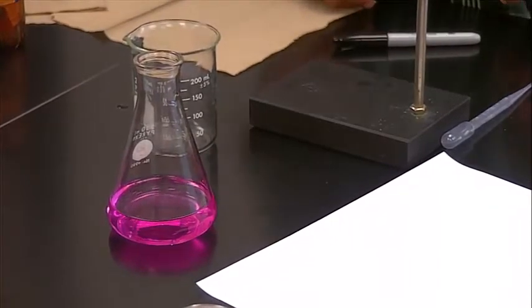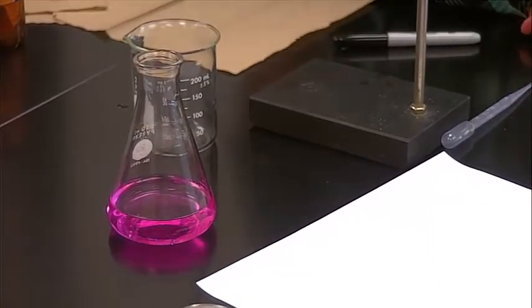Let's read now what we have in our burette. Endpoint was about 19.50, maybe 19.51 mils. So it took 19.51 mils of NaOH to neutralize all of the vinegar. If you take a look here, I probably overshot it a little bit. So you've got to be careful around 18 mils, 17 mils, and start adding it drop by drop. But this is not bad.